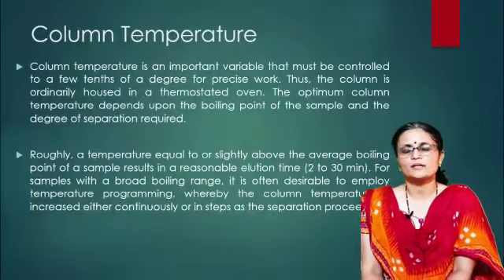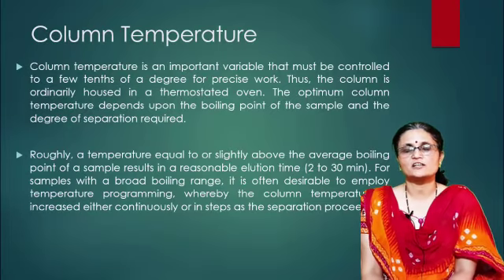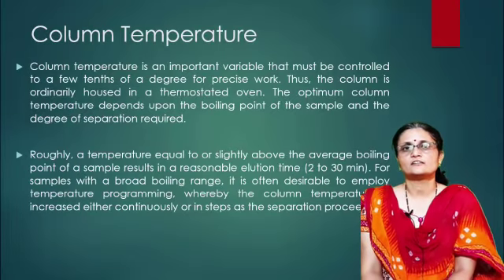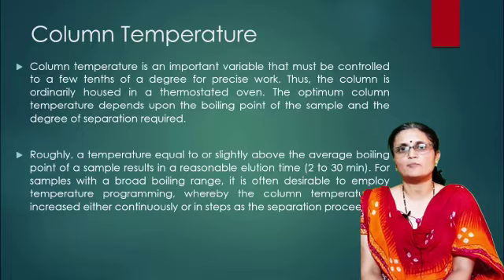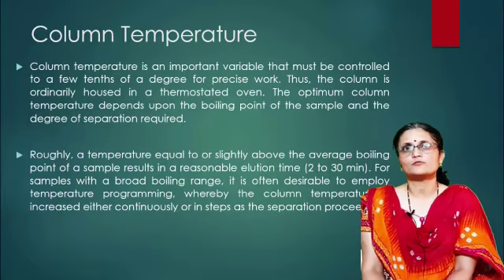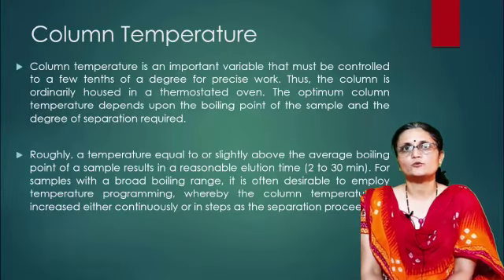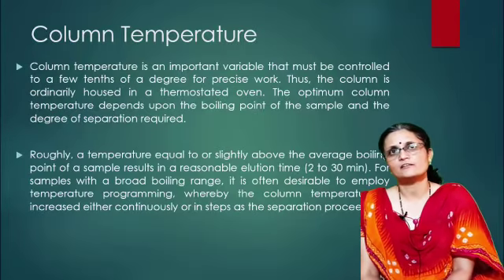The column temperature is kept in such a way that the sample that is injected should remain in the vapor form without decomposition. Generally, temperatures above the boiling point of the sample are selected.